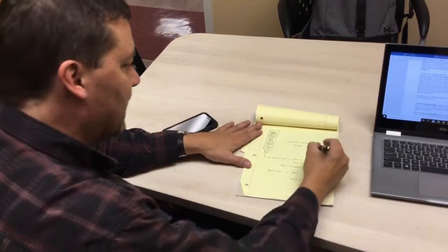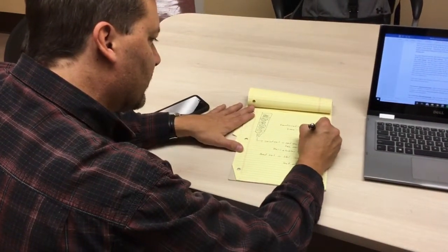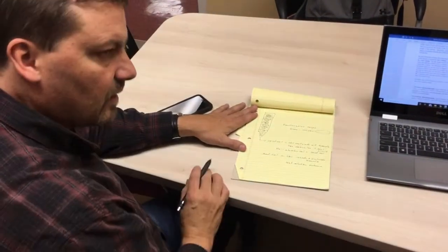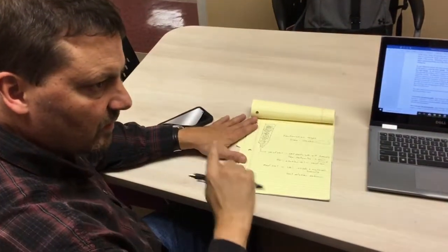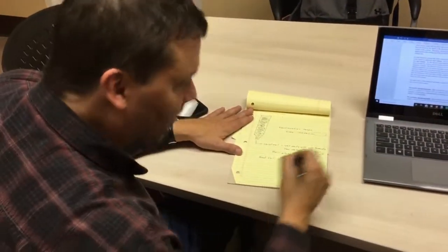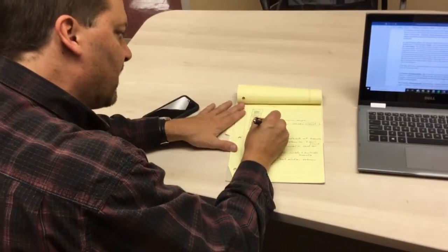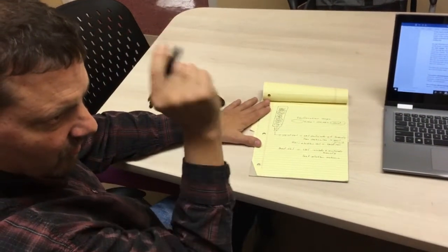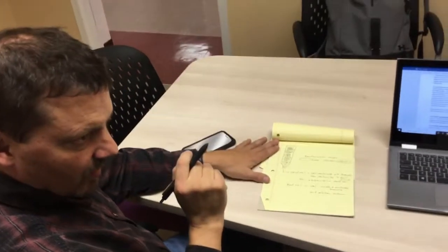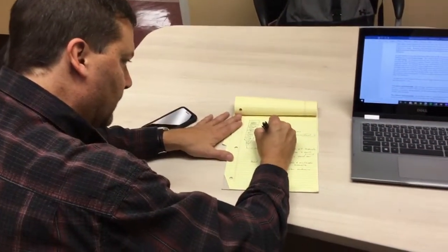Anything that is larger than 100,000 is going to be excluded from the beads. It will end up in the void volume. Anything that's smaller than 5,000 will have access to the entire internal volume, so they'll come out in the bed volume.